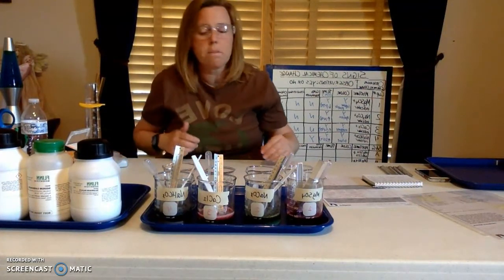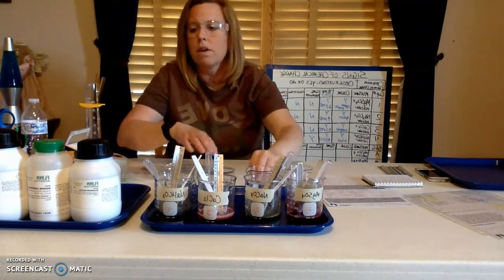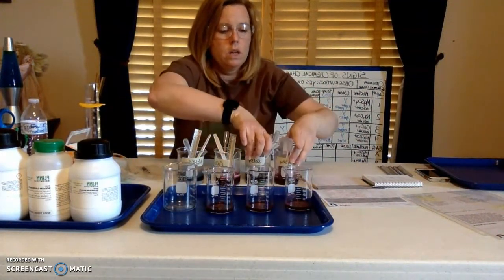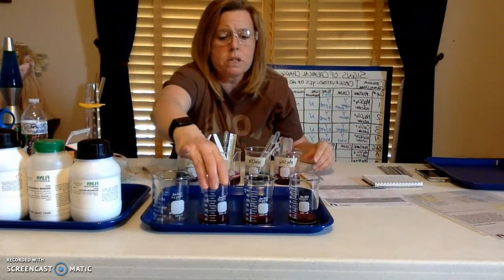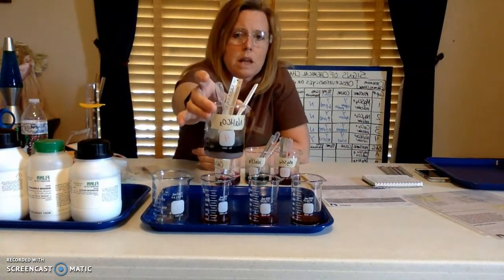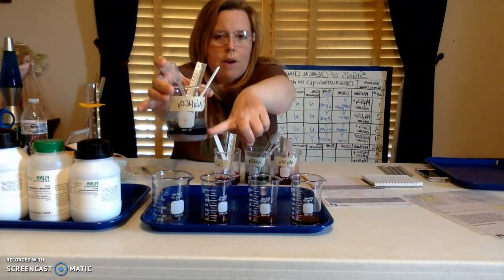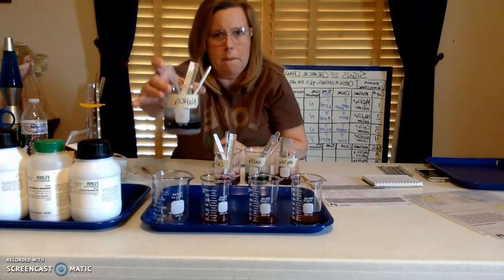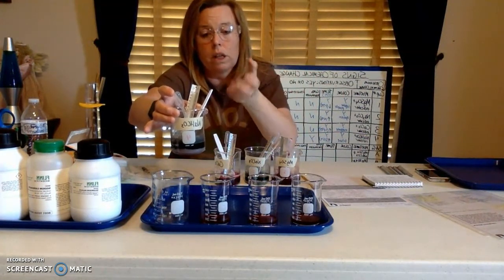All right, so the second part of this, I'm going to move right along, I don't want to make this too long, is I have a switch here now, so you can see these, in beakers A, B, and C. It recommends we do it in baggies, but a precipitate, that's another awesome phenomenon that I saw. The precipitate, as you can see, was like the oil and the water that we mixed earlier in our last unit. A precipitate is like this cloud or this separation that happens with more powerful chemicals, like in chemistry. It'll just kind of float on top and look like a cloud, literally like a cloud is formed.